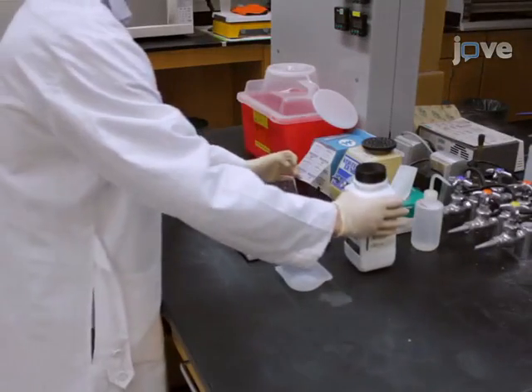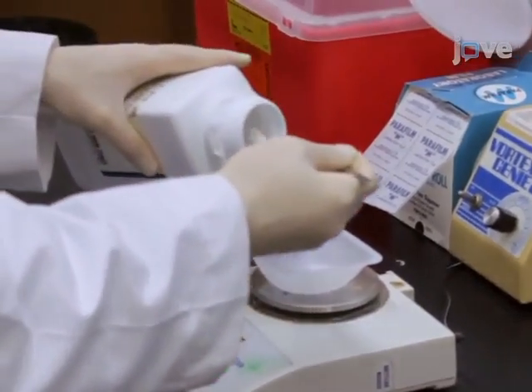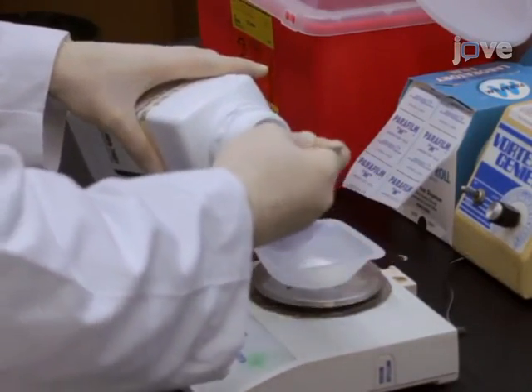Agarose gels are prepared using a weight over volume percentage solution. The concentration of agarose in a gel will depend on the sizes of the DNA fragments to be separated.